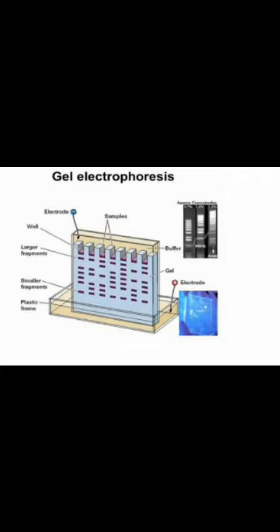And the next application: gel electrophoresis is used to provide genetic information in a wide range of fields.